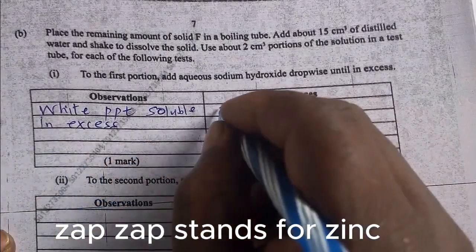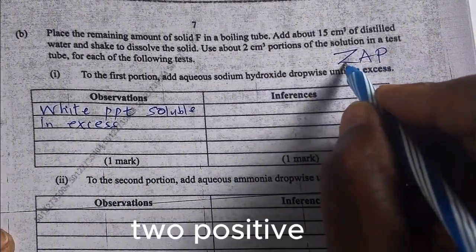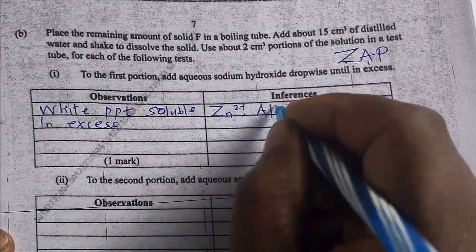ZAP stands for zinc, aluminum, and lead. So this is Zn²⁺, Al³⁺, and Pb²⁺ present.